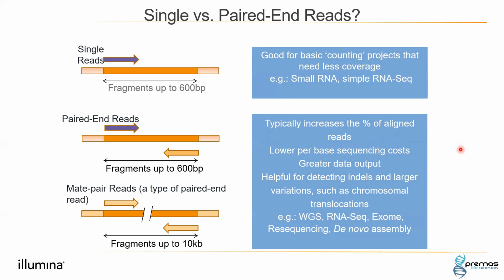Paired end sequencing offers you two benefits. At the end of sequencing, there is a loss in data quality, so if you are overlapping the reads, you might cover it in your second read. Second is the alignment part. Two sequences need to be aligned to the reference genome, so you have two points to align, which gives you a better alignment.